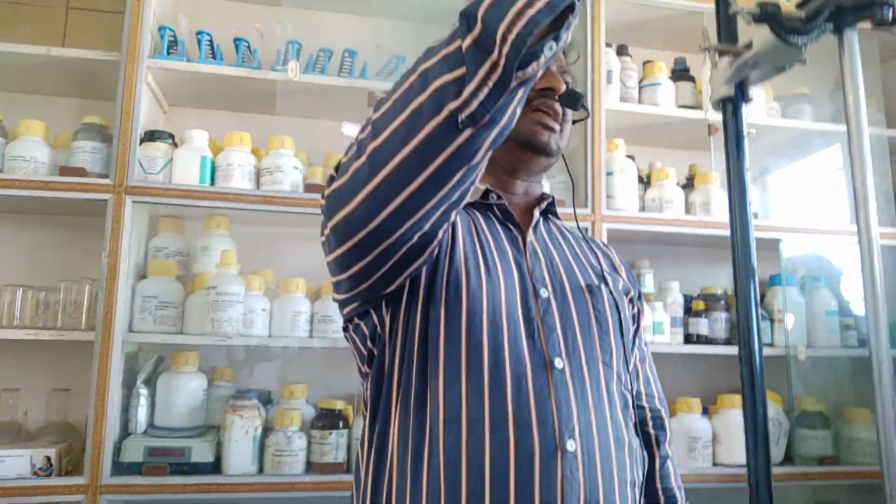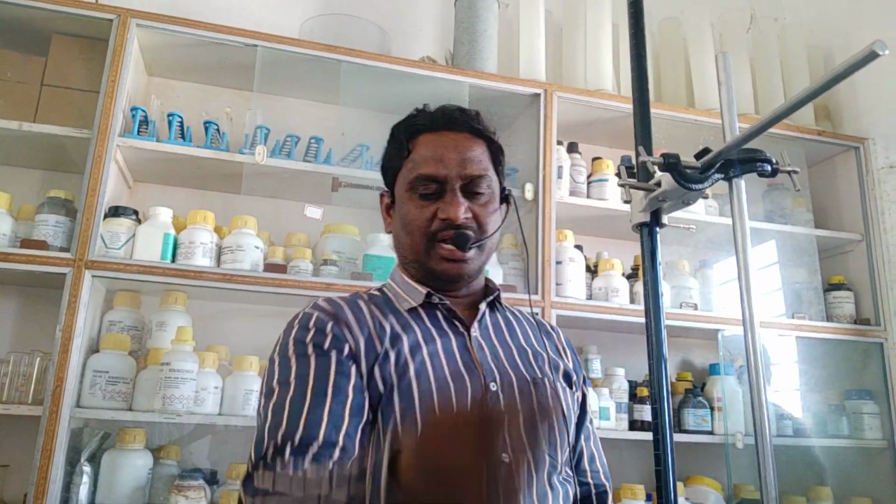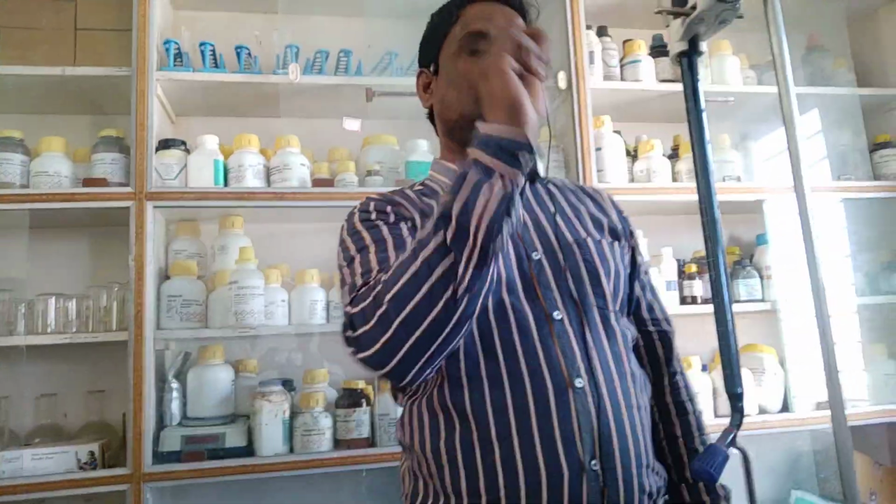So this is called titration. We are titrating KMnO4 against the FAS solution. Be careful while performing this experiment. The starting reading should be 0. While releasing, this is called the stopcock. Slowly release, dropwise only should fall.